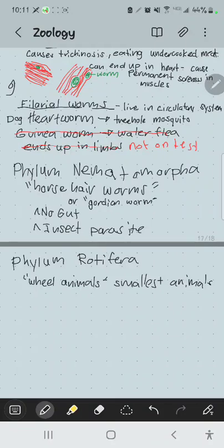There's kind of a rotifer here. And the main thing is this is called a ciliated corona, which corona is just Latin for crown. So they have this paired ciliated disc at the end of their body, and the mouth is located here. They use that ciliated disc for locomotion, and then they have a complete gut tract. But the main thing to note, the reason why we're mentioning these today, is the gut is entirely endoderm. It's entirely endoderm. The mesoderm is only lying on the outside, so they have a pseudocoelom.